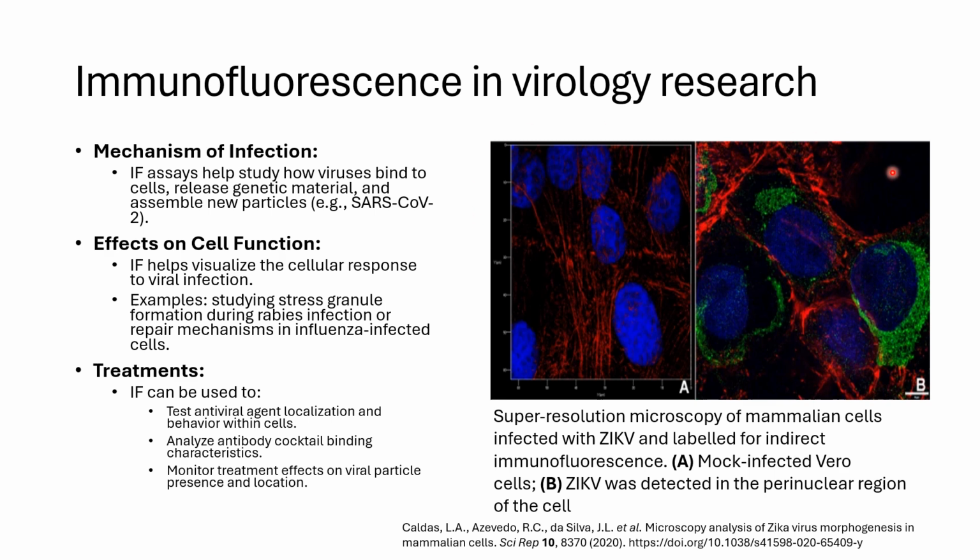Here is a super-resolution microscopic image of mammalian cells infected with Zika virus and labeled for indirect immunofluorescence. This represents mock-infected Vero cells, which are the control cells that are treated with all reagents but not the virus. These are the Zika virus-infected cells. Here we can see the Zika virus in the perinuclear region.